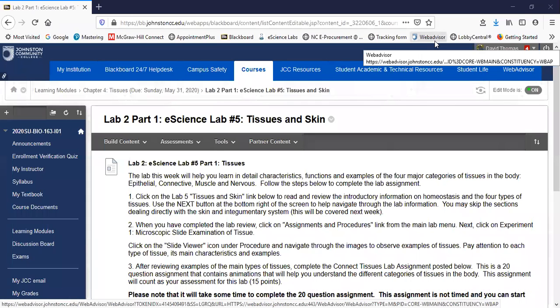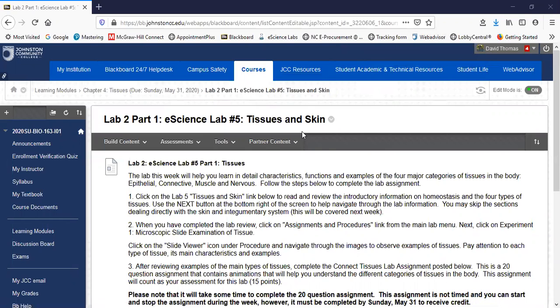Hey guys, in this video I'd like to give you a brief introduction to completing some of the eScience labs that are required for the course. What I've done is pulled up my Blackboard course here for 163, and this is one of the first labs using the eScience kit that you'll need to complete. This is my lab number 2, part 1. That corresponds to the eScience lab number 5, which is called Tissues and Skin.